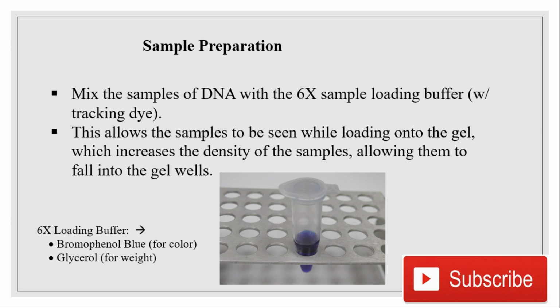Bromophenol blue gives the blue color, and glycerol adds weight to the DNA, so it will be properly loaded and sink down in the gel. Sometimes if you are not using the loading buffer, you will not see whether the DNA goes into the well or not. So the DNA sample should be dissolved with the loading buffer dye before loading.